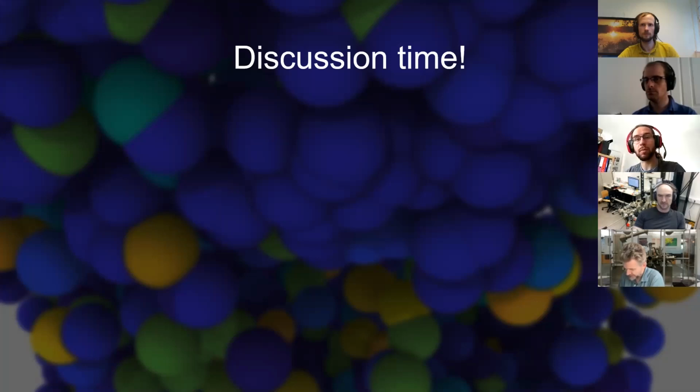We'd be happy to include something. I think libAtomProbe gives you most of the basic tools you need if you just had X, Y, time of flight to then turn that into an actual reconstruction. But we're not working on that data. We're mostly working on data that's already been reconstructed. So I think there's a good opportunity there for working with Peter and Patrick, etc., to try and get that full reconstruction chain actually there as a basic tool that people can use. I think there's just not been the need for it at the moment.